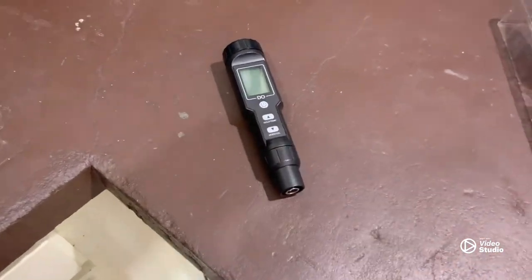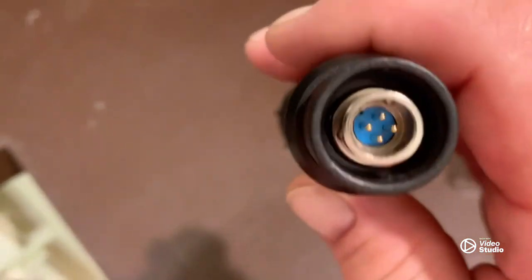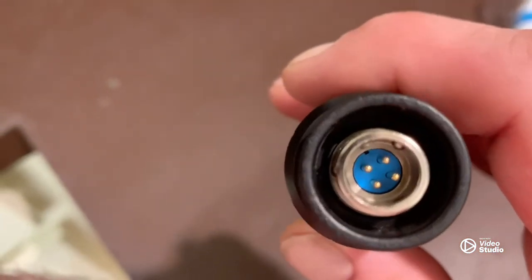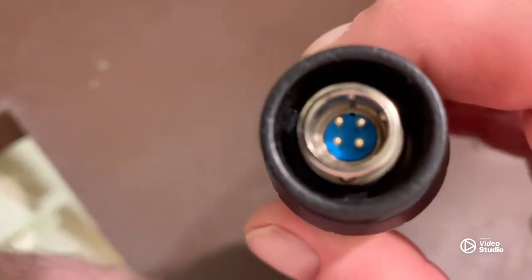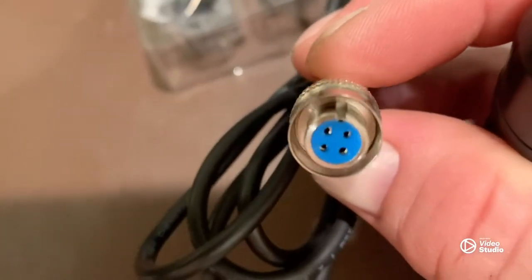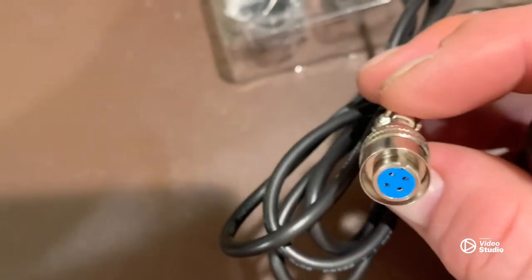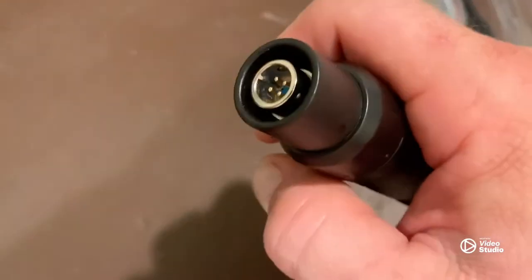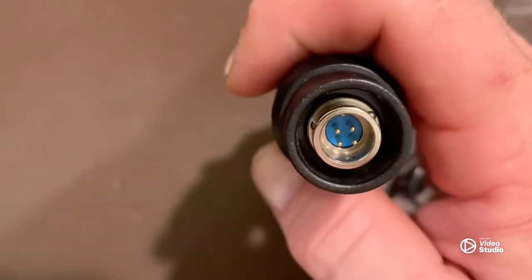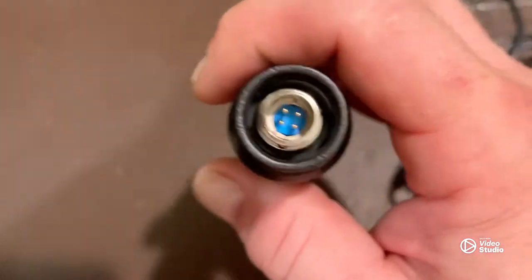There's a cap on this which you remove, exposing the connection point for the probe. You'll notice there's a little notch right there, and there's also a notch on the probe end — those have to line up. When you line it up it'll slide on easy, and then this little collar will click into place with those little ball bearings.